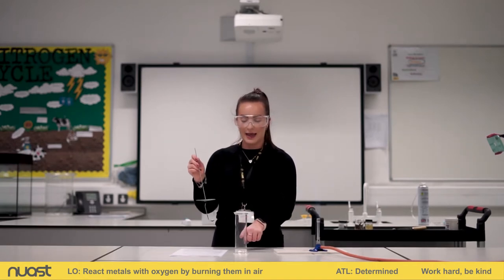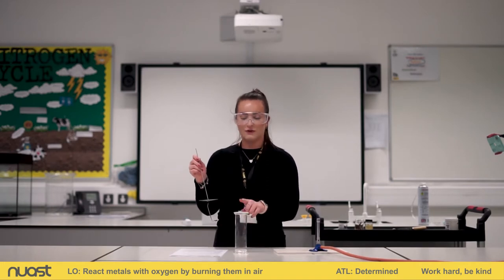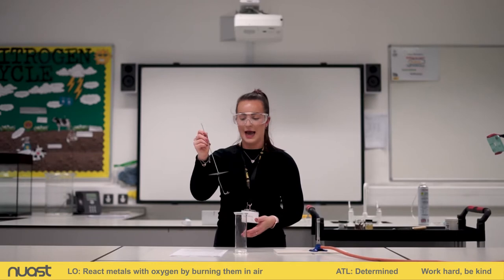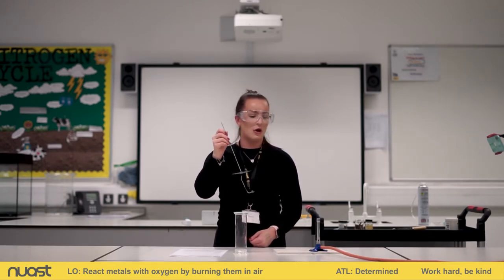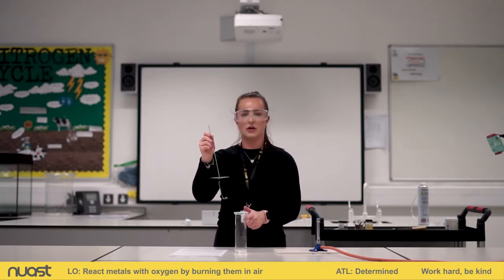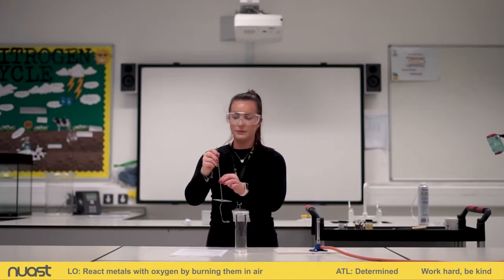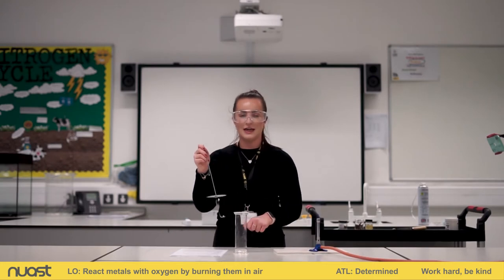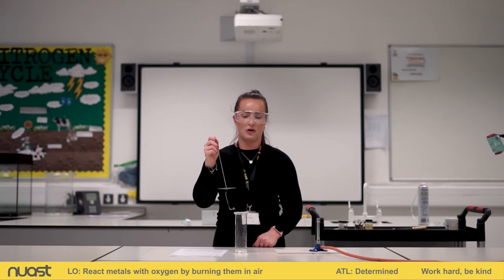And then what I've got here is a cylinder that's filled just with oxygen. So I've just filled that with pure oxygen, and we're going to see how the flame and the colour that we get from burning the magnesium changes from it reacting with the oxygen in the air, which is going to be in a lower concentration, to it being in the cylinder. So what I'm going to do first is hold it in here for maybe 20 seconds, and then I'm going to quickly take off the lid from the oxygen and put it straight in there. So hopefully you'll be able to see that on both cameras.